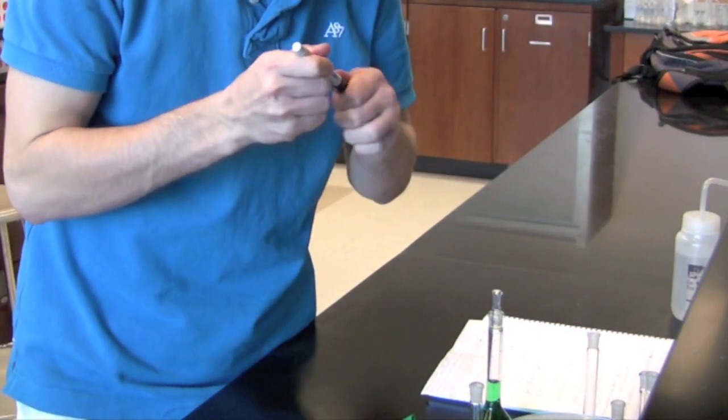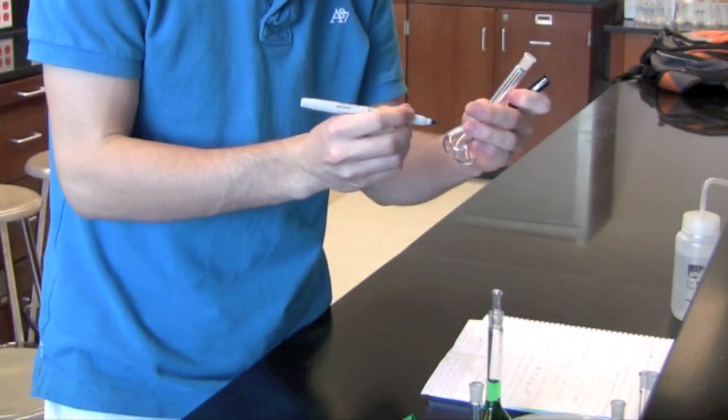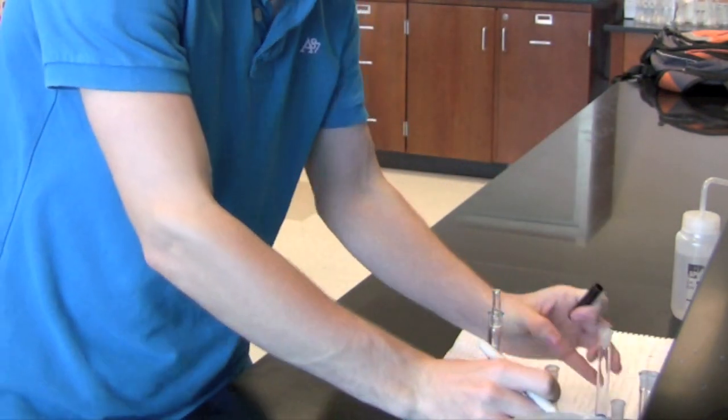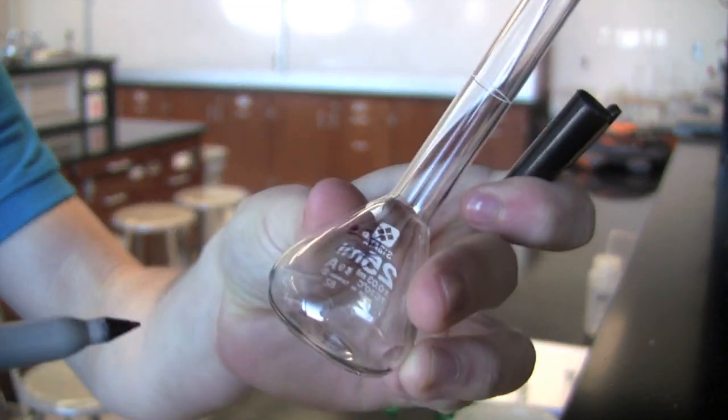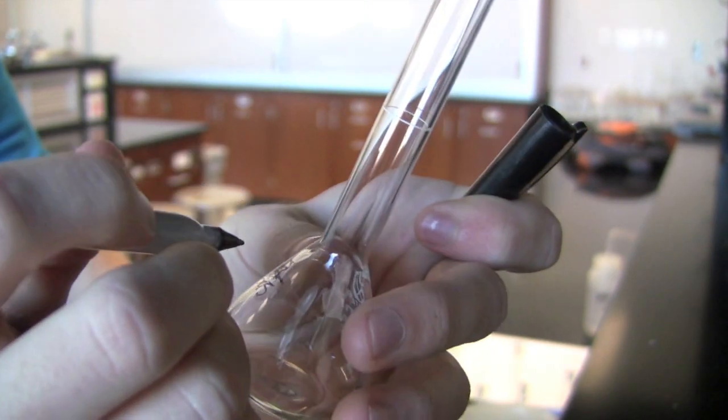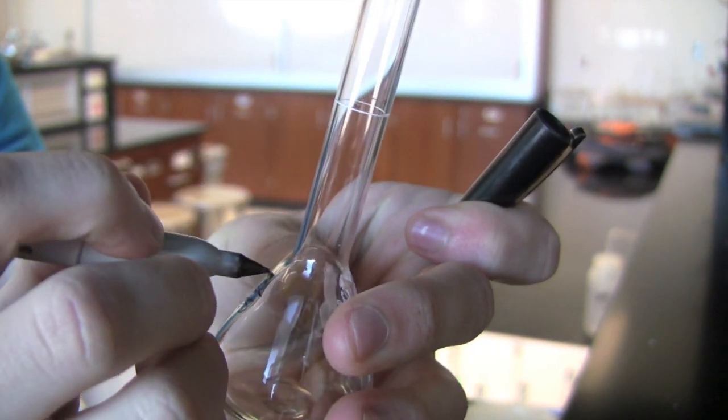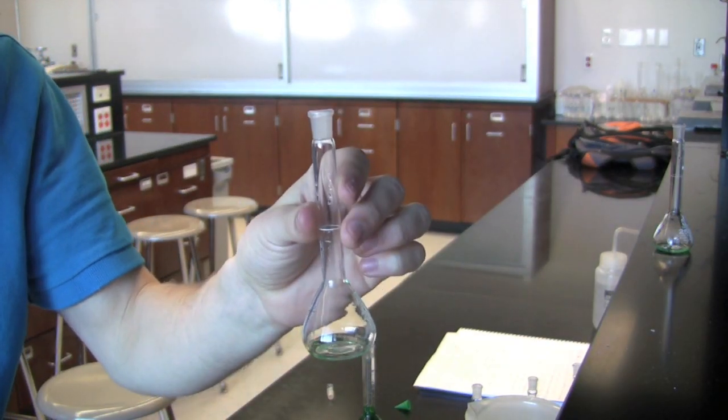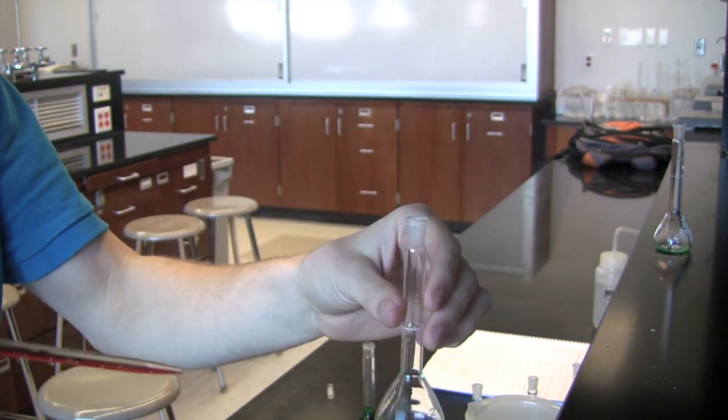Go ahead and label the volumetric flasks with a sharpie as 0.2, 0.4, 0.6, 0.8, and 1.0 milliliters over 25 milliliters. This lets us know the ratio of stock solution versus the total volume of diluted solution. Continue this procedure by adding 0.4, 0.6, 0.8, and 1.0 milliliters into the appropriate volumetric flasks.